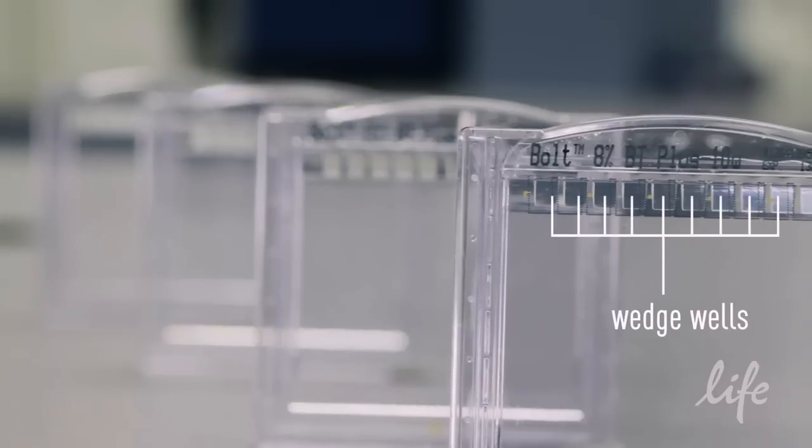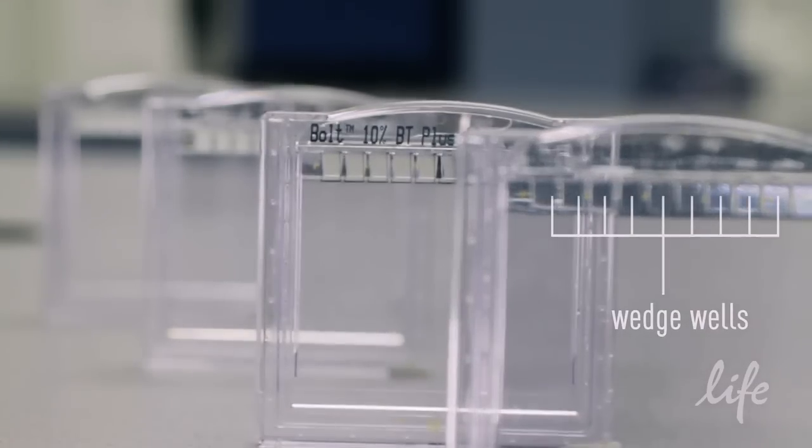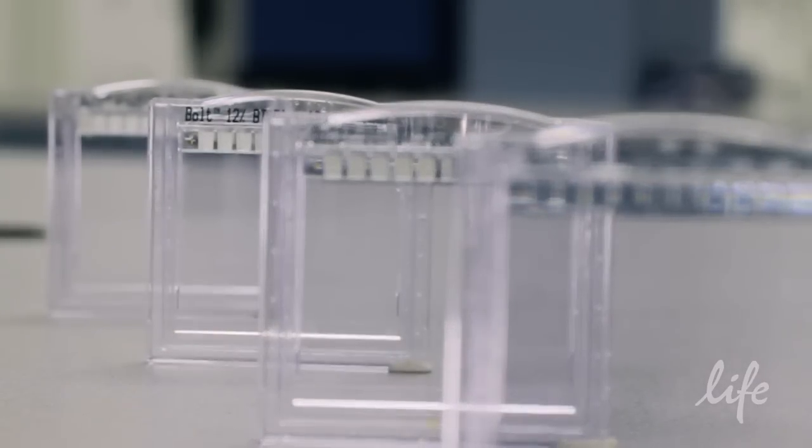All Bolt Gels have unique patented wedge wells that allow you to load up to 50% more sample.